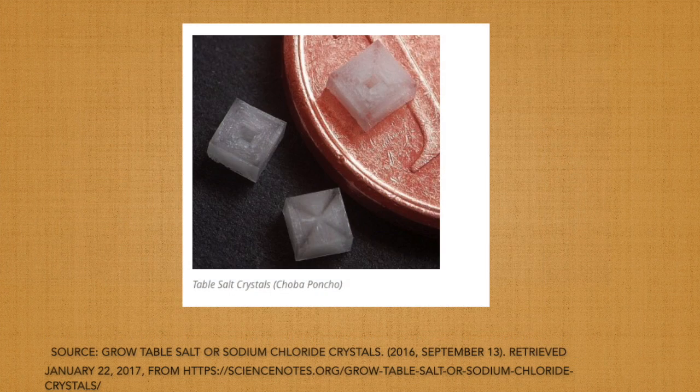For this reason, sodium chloride crystals would best be made by using a slow evaporation technique similar to the one we are currently using for the alum crystals. To put it simply, NaCl would be dissolved in nearly boiling water until the solution was completely saturated. Then this solution would be placed in a container and be left alone for several days. As the solution evaporates, crystals would begin to form on the edges of the vial.